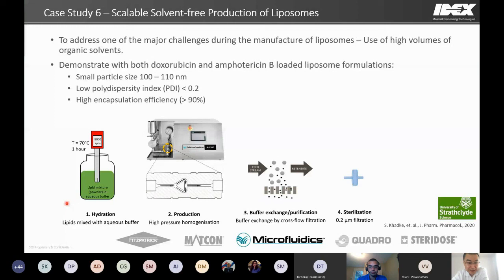It is also discussed in the paper, and I wasn't showing the results here. Depending on your formulation, there is a limitation on how much lipid, or the lipid concentration, you can put in there. We tested with different formulations, and we found there were different limits. But in general, we can go very high. Some formulations we achieved as high as 80 or maybe 100, if I remember that correctly, milligrams per mL as the lipid concentration, which is usually pretty high for liposome formulations.